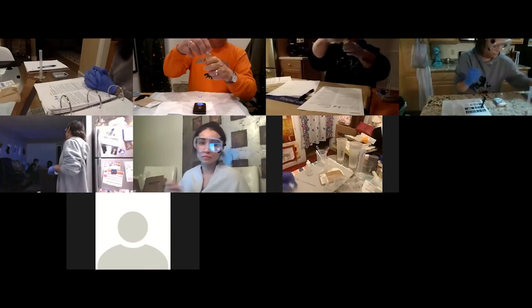Oh man, you can see that they didn't put the cap on this quite tightly enough, and it's leaked out.